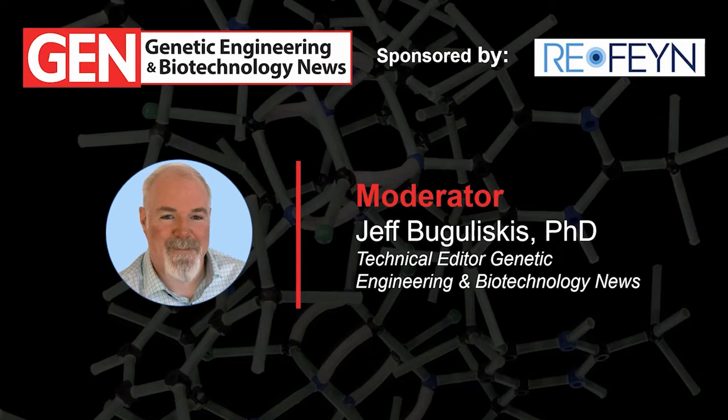Now, the continued success of gene therapy research has placed a demand on the biomanufacturing industry to produce the go-to therapeutic delivery molecules, which for so many gene therapy endeavors is adeno-associated virus, or AAV. Many of you already know about AAV and its role in delivering gene therapy products, as it's been widely studied for a number of years.